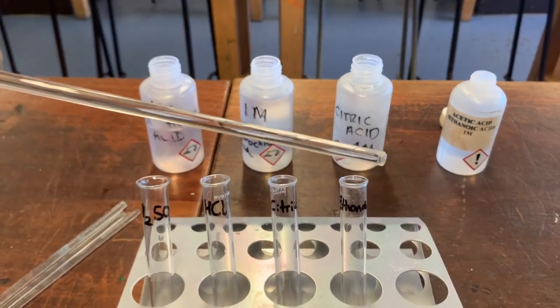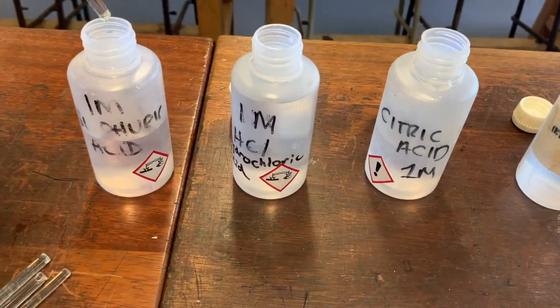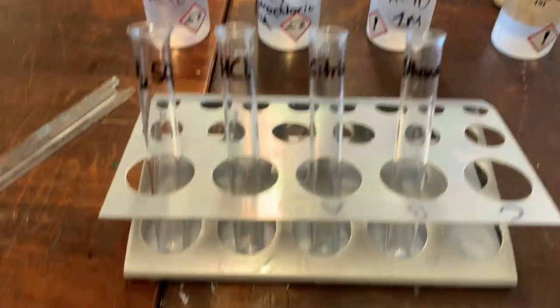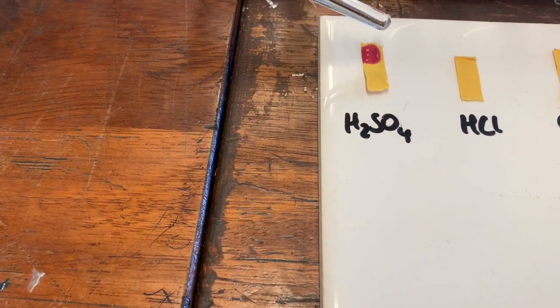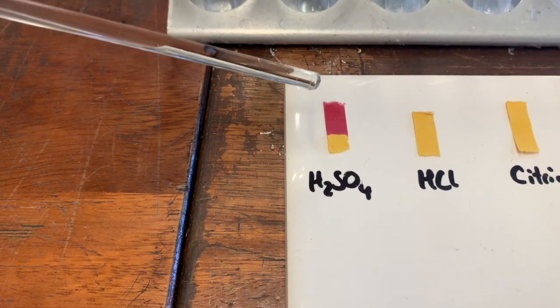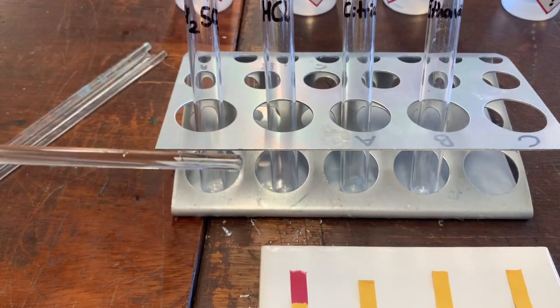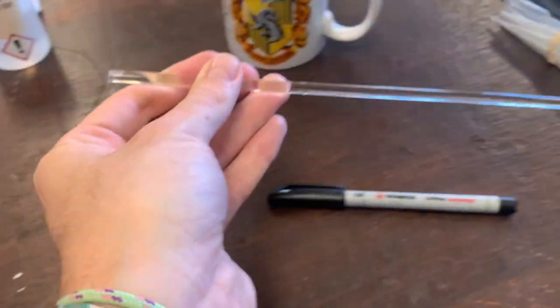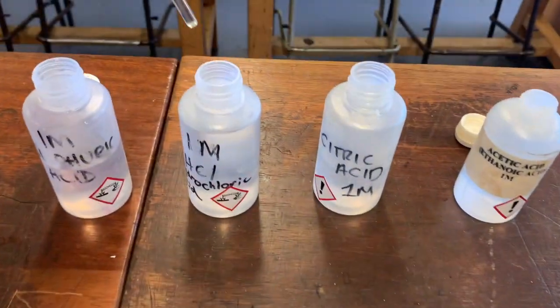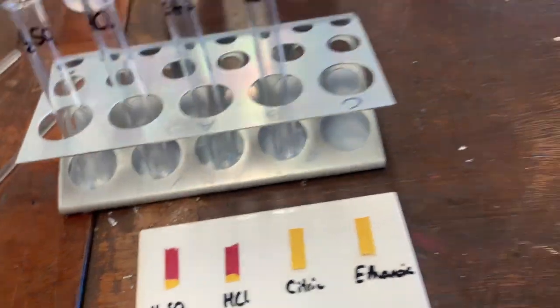To do this experiment, I'm going to use a glass rod and just take a very small sample from the tube itself. I only want one drop, and I'm then going to place that drop on my spotting tile. You can see that the color has changed — this was for my sulfuric acid. Let's repeat this for the others. Because the glass rod is now contaminated, I can't use it again, so I'll put it to one side and use a new stirring rod. Let's try this in the hydrochloric acid — wipe off any excess and put one drop on there.